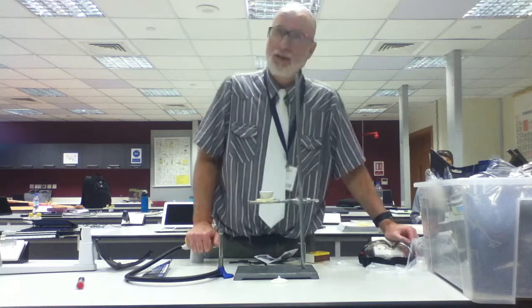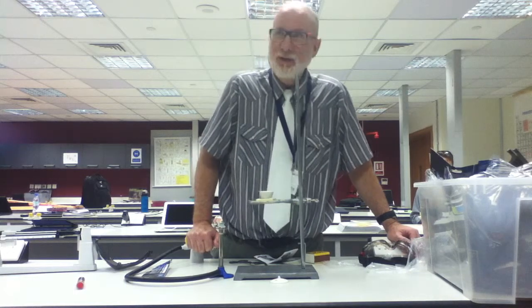Drink the liquid in the Erlenmeyer flask, true or false? False, excellent, I feel better. No kidding around here, this is serious stuff. Take the acid, put it in your hand and splash someone's eyes. Would you do that? False. Excellent.